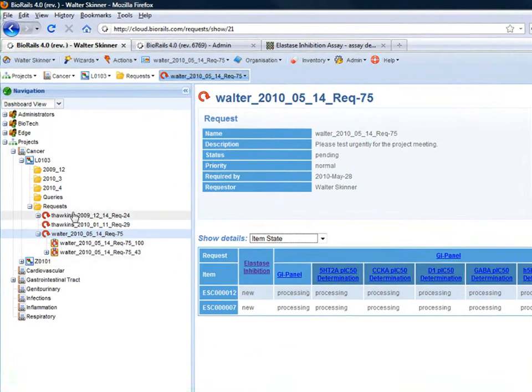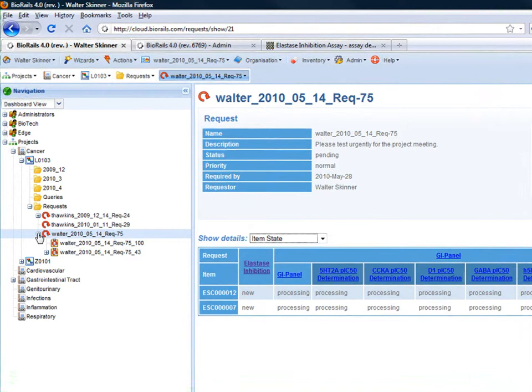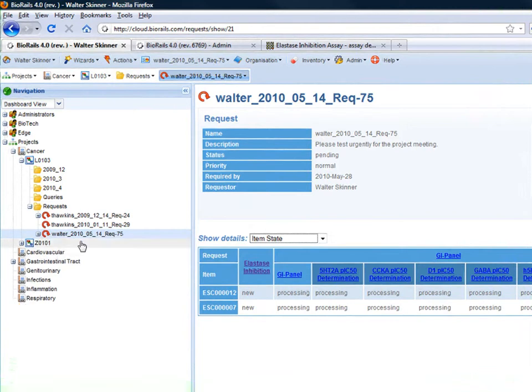In this way I can track the progress of the project in terms of the request that is being made. And of course I can access the results at any time.